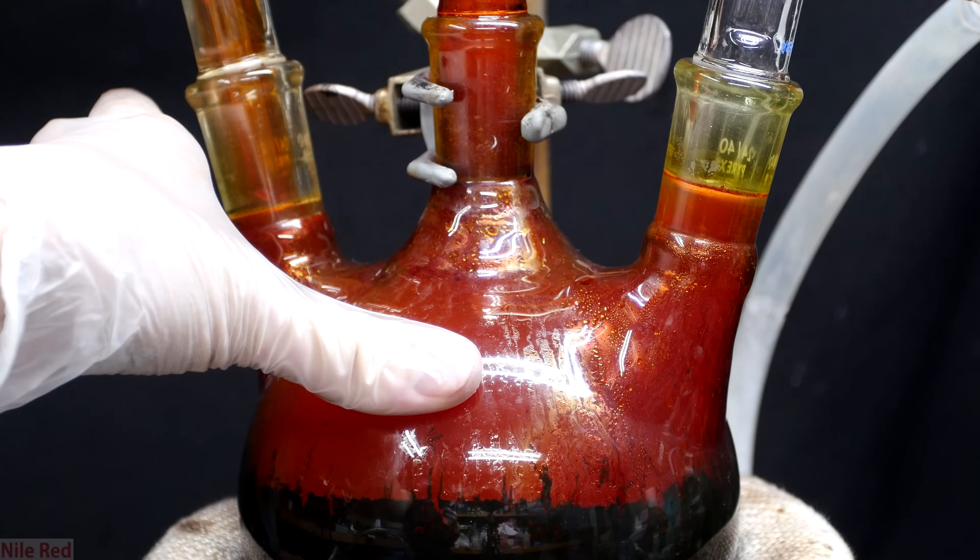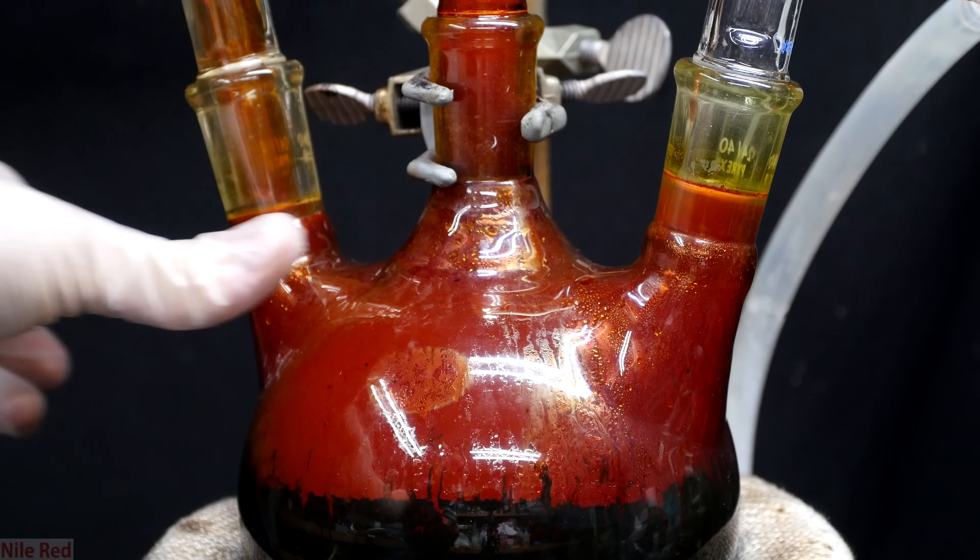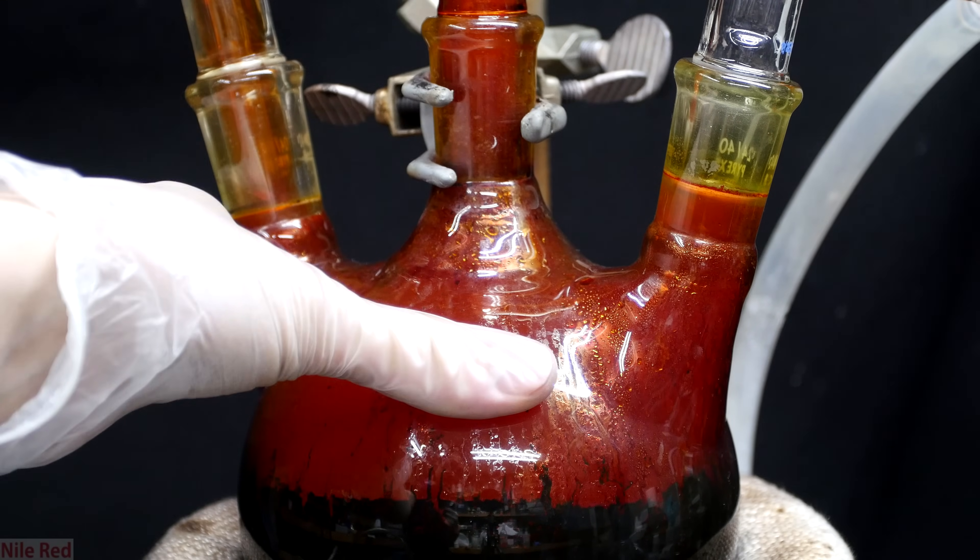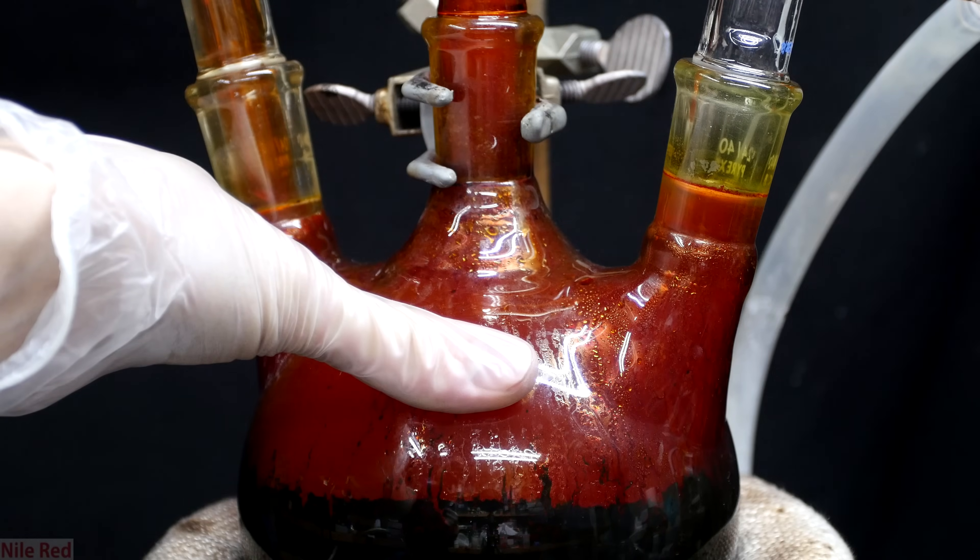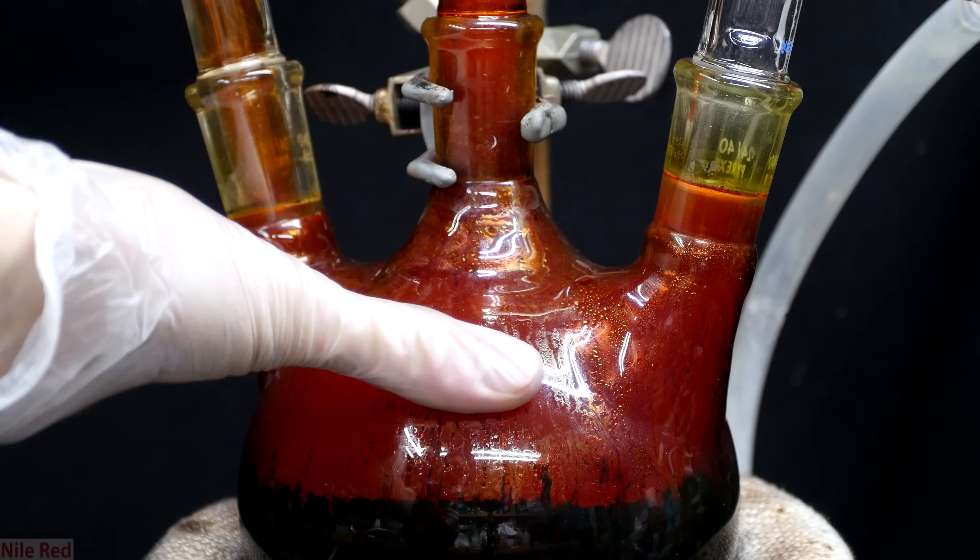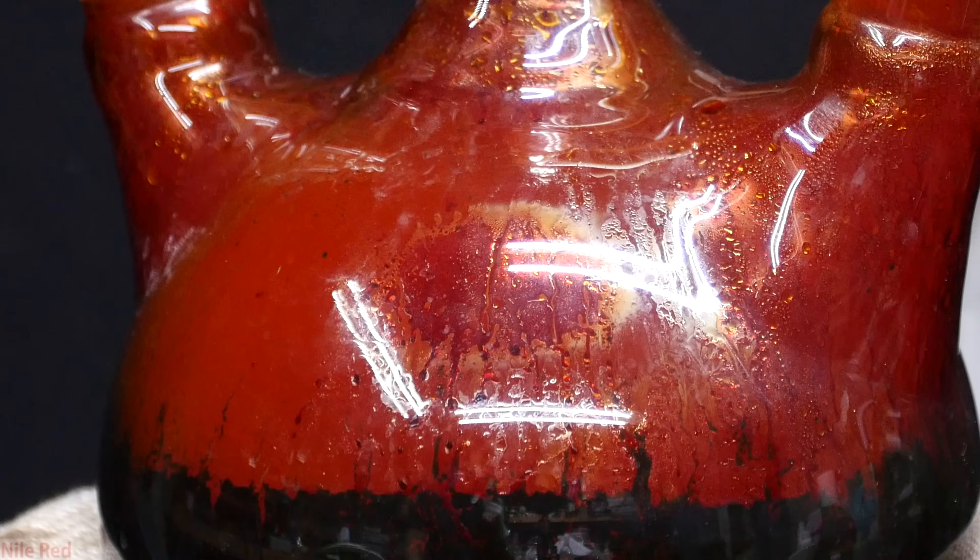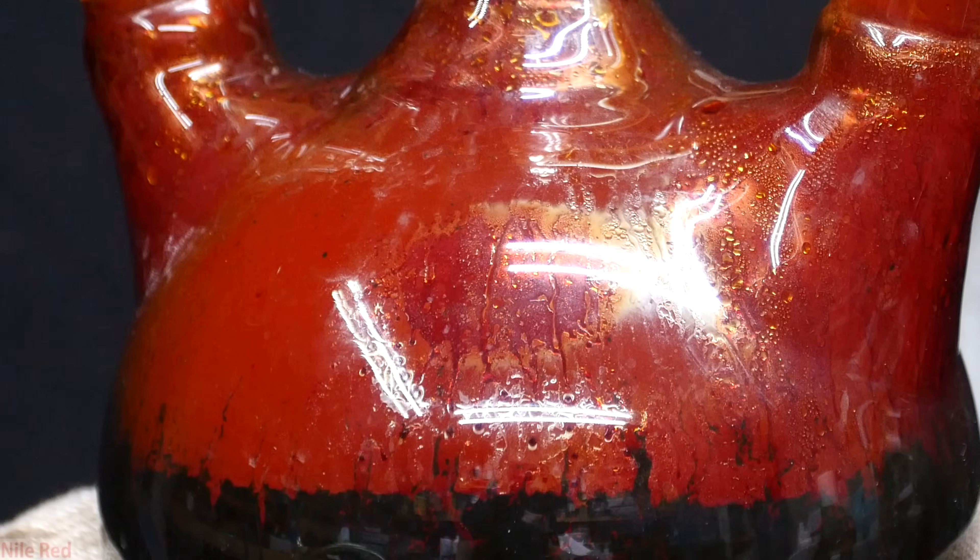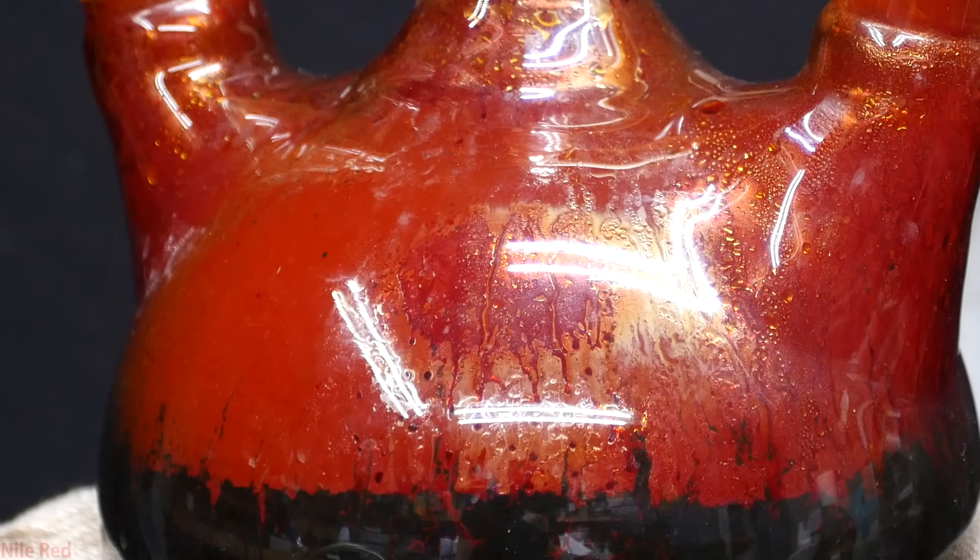Bromine has a boiling point of 58.8°C, which means that it's not too hot to touch. When I put my thumb against the glass, it actually cools it down enough that bromine starts to condense. I thought it was cool that even after I take my finger away, you can see where my thumb was and it's still condensing bromine.